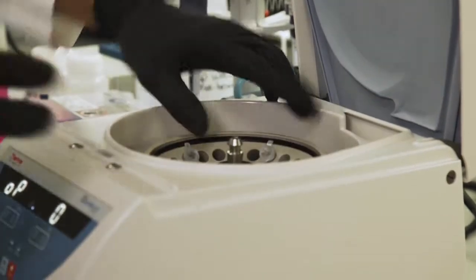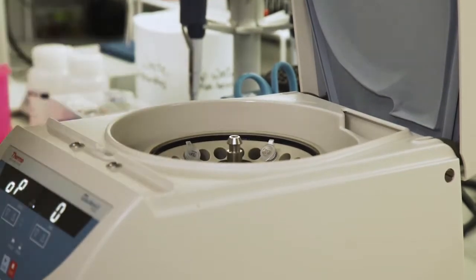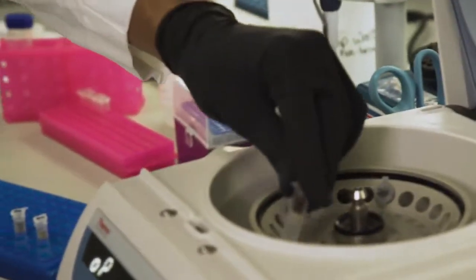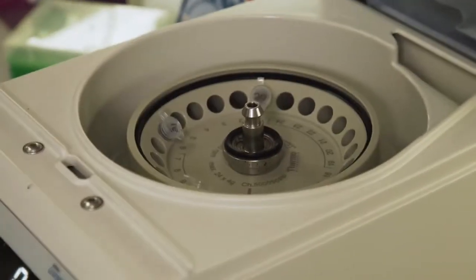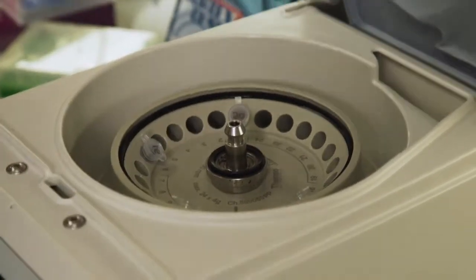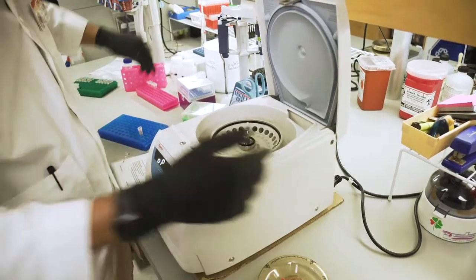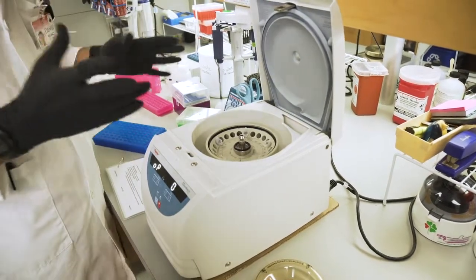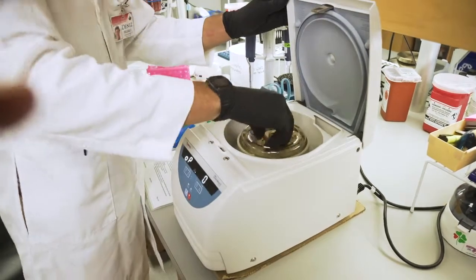If you were to put all these together, it'd be like throwing something like a brick into a dryer or a washing machine. You'd hear it going boom, boom, boom. And at the speeds these spin, that can be really dangerous. It will definitely damage the centrifuge, and it'll throw it off balance, so it won't spin as well. But this is a small centrifuge. We have a bigger one in the lab that's probably, the center part's 2 to 3 times the size. And that at full speed, if it were to become horribly unbalanced, parts of it would come flying, and that would be really bad for anybody standing next to it.